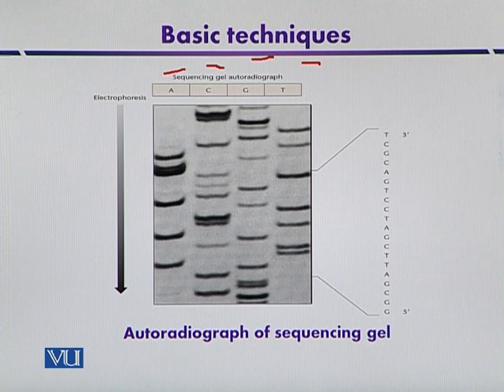these DNA fragments were radiolabeled and then placed with X-ray film, and then the separation of different molecules was visible in the autoradiograph. So this is a typical procedure by which we can detect the radiolabeled fragments by using autoradiography.